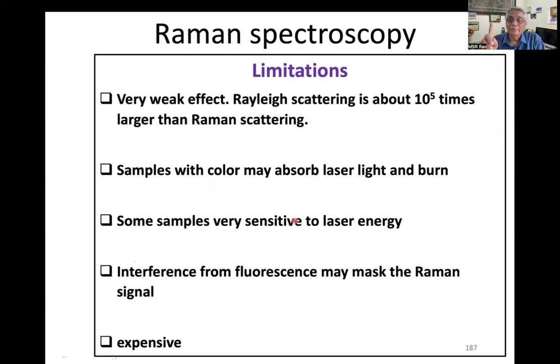If the sample on which the laser beam impinges absorbs that energy, of course, you're able to record the spectrum, the Stokes shift or an anti-Stokes shift. But in that process, if the sample also gets heated up to 50, 60 degrees centigrade, its local molecular structure can change.